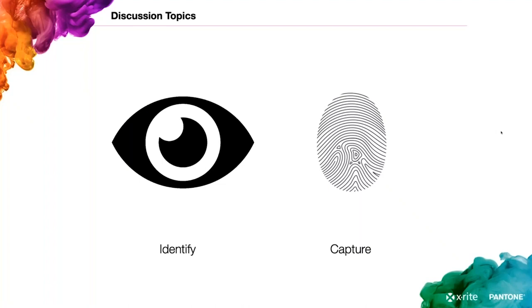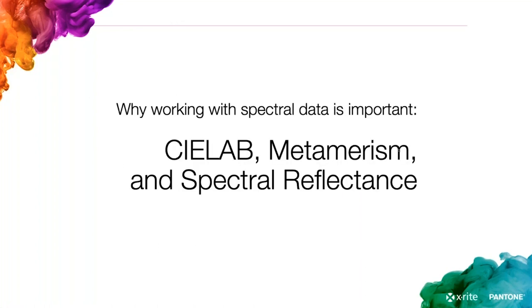So in today's presentation, we're going to cover two topics. One is identifying color. I want to walk through the limitations of specifying CIELAB values. And two is capturing color. I want to explain the differences between color measurement instruments and when to use them when you need to capture color information.